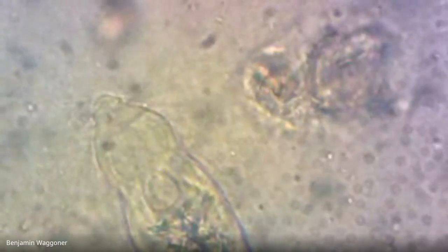It's a Trichonympha-ish thing. You have that cone-shaped head surrounded by a ring of many very long flagella, if you can see those twitching back and forth. There again, down more or less in the midsection of the body, you can see a pretty large nucleus.